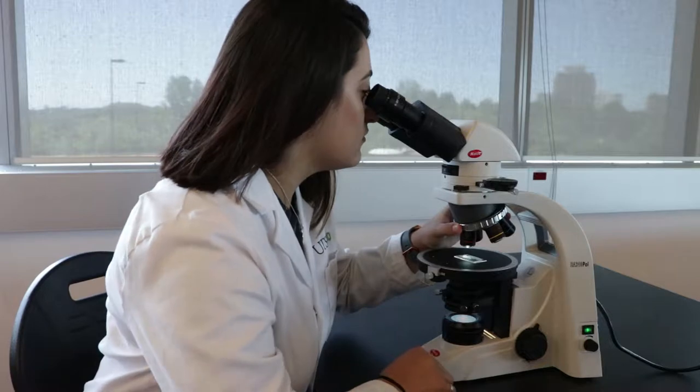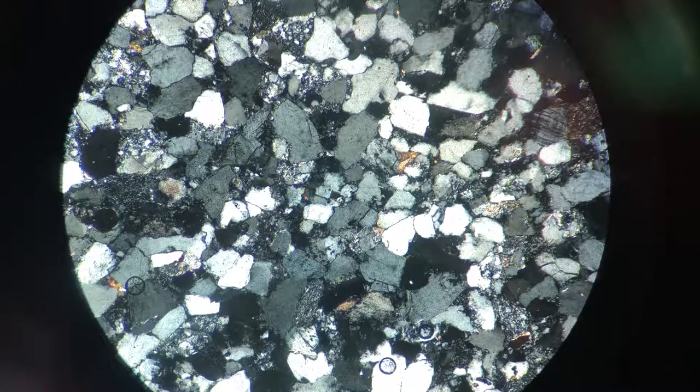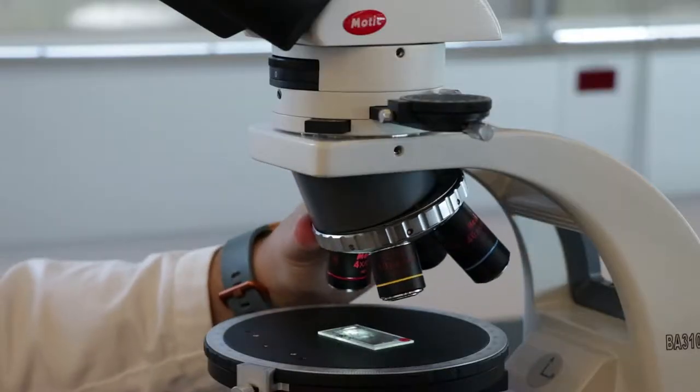Sometimes, your thin section may show incorrect interference colors in XPL. To test for this, it's best to look at the minerals quartz and feldspar as they're very common and easy to identify.